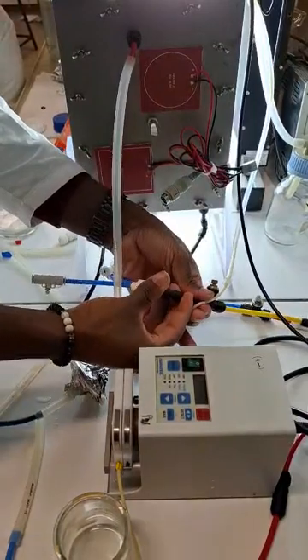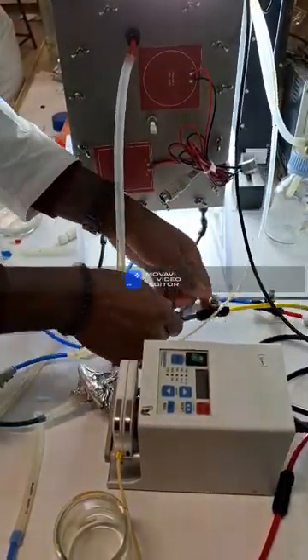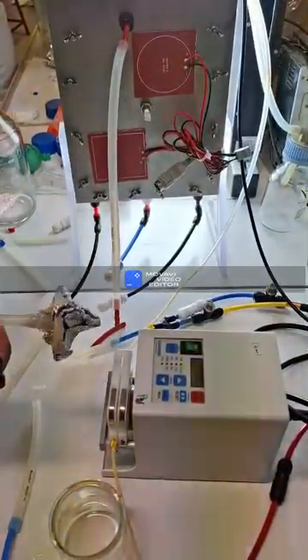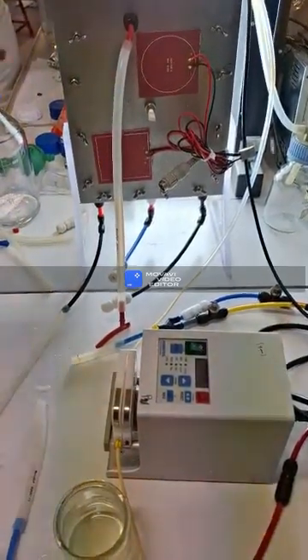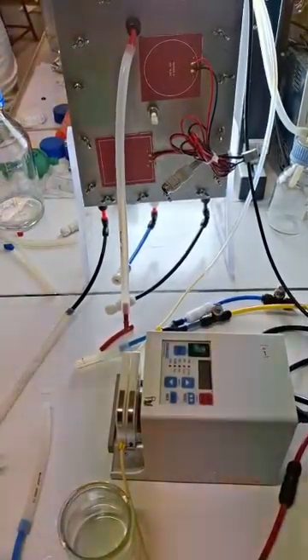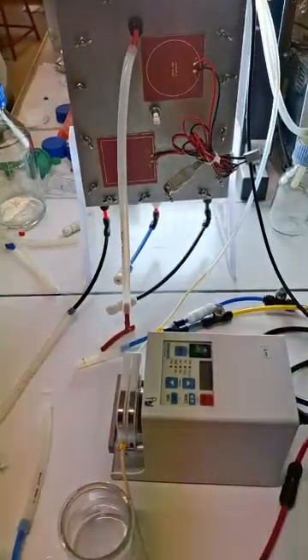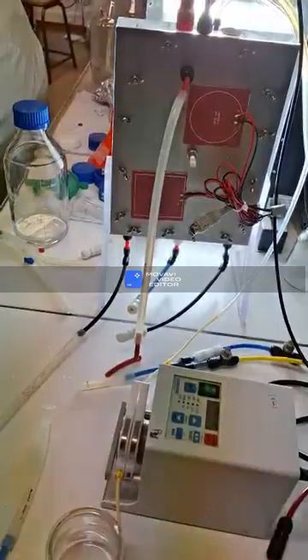Okay. So I plug it here. The thing is that it is autoclaved. So I will show you how to use fire. It's there. Yes. Very good.